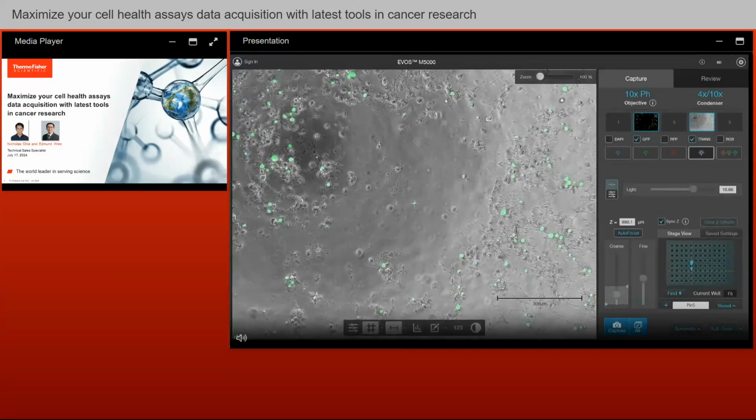You can see these signals exhibiting in green on these cells which are going through that process. So this allows you to track your drug treatment over a time course, so you can actually come back to the same locations and monitor them accordingly. So this is all for the live demo, and we'll go back to the presentation.